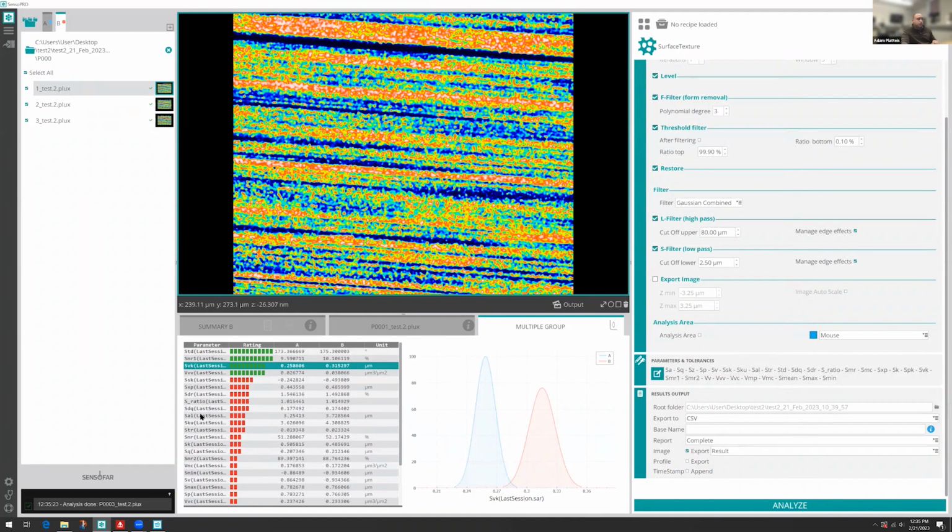So there could have been a change on the sample as we have about an inch by an inch area in X and Y that we covered. And there may be some damage to one of the sides of the part versus the part that we imaged here. So we should naturally have a different result, which you're seeing here in this bottom center area. So this is how Senso Pro ultimately operates for our customers.